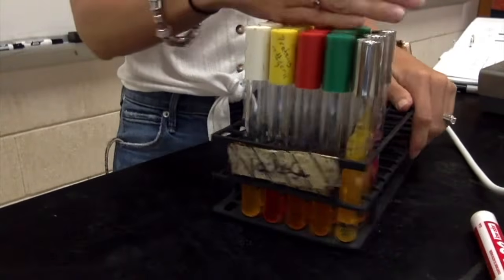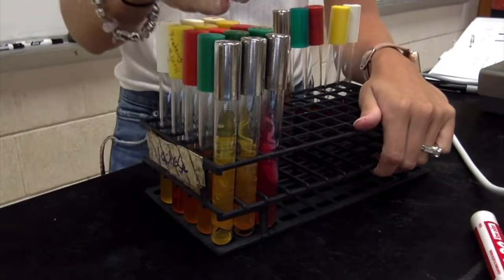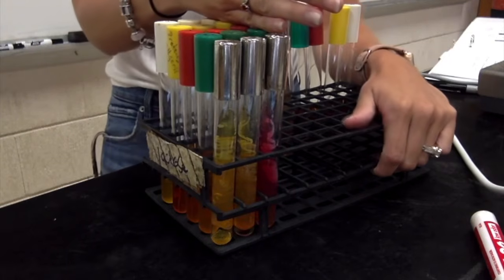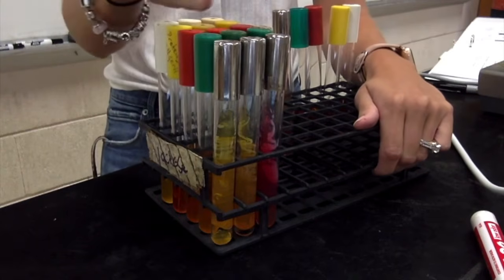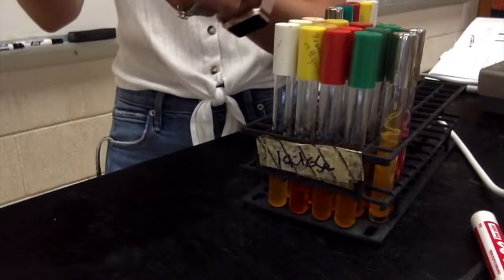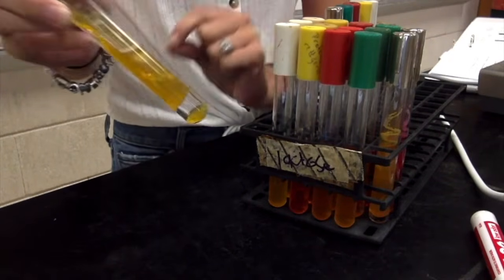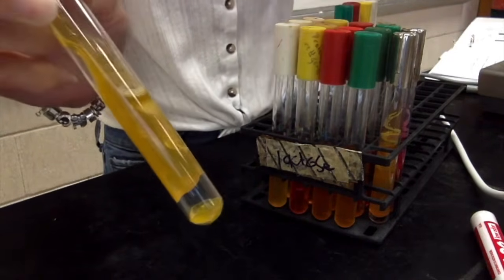I have 3 different bacteria that I did for the carbs and TSI. I did E. coli, Citrobacter freundii, and Pseudomonas. So those are the 3 bacteria that I inoculated for carbs. So let's start out by reading the E. coli tubes. So we'll start out with our TSI. Remember, the first part that we have to read for the TSI is the slant over butt. So what color is the tube? As you can see, my tube is all yellow. Remember, it started out this color.